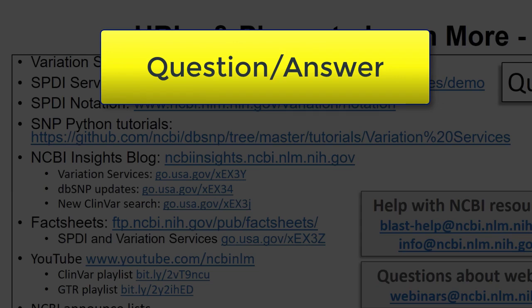Now we're talking about VCFs as an input file. They wanted to know if you're going to put in a VCF input file for, let's say, a SPDI batch, how would you specify the build itself? Let's say they want to actually do a search on build GRCh38 as opposed to 37. So I think you have to pass the assembly accession number, and Lon can correct me on this. Right. There is a parameter for you to pass the assembly accession number, so that we'll know which assembly you're referring to for each of the chromosomes.